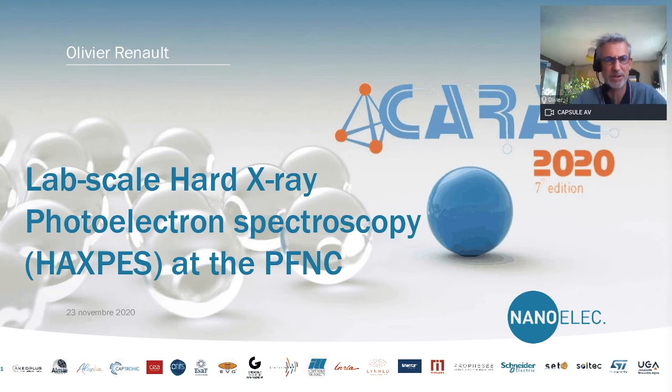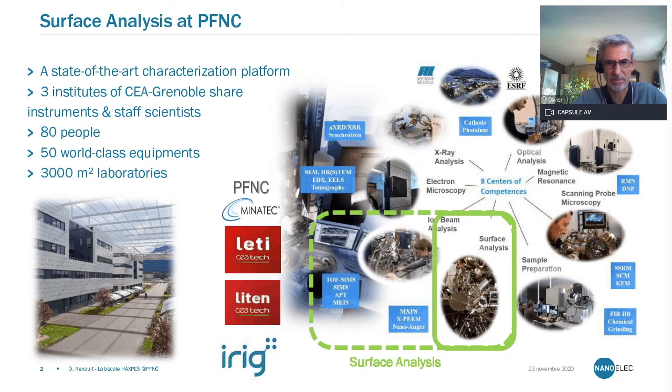And I will be talking about new capabilities that we recently acquired early this year. And it is about lab-scale hard X-ray photoelectron spectroscopy, HAXPES. So I will be starting by giving you an introduction regarding the platform for nanocharacterization of CEA, because actually CEA-Leti is part of this platform.